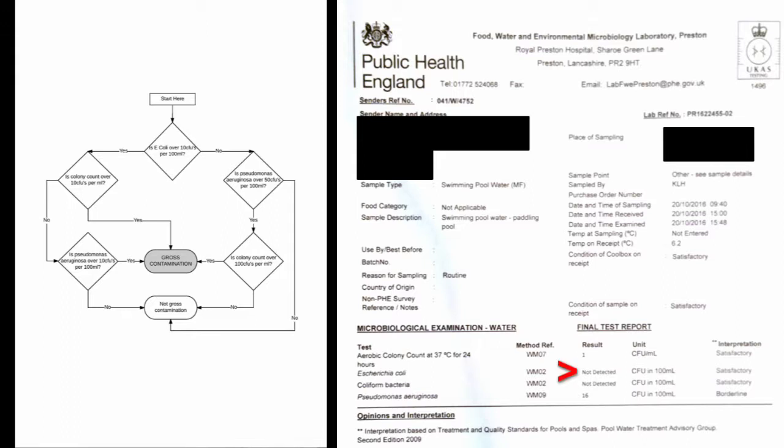So you follow that arrow, and the next question it asks is, Pseudomonas aeruginosa over 50 colony forming units per 100 ml? It's 16 on the report, so you follow the no arrow and it takes you through to not gross microbiological contamination.